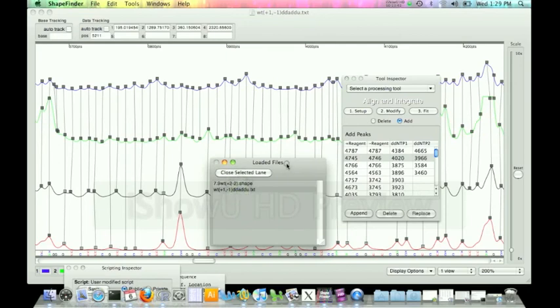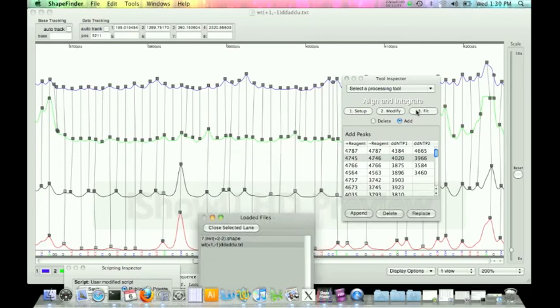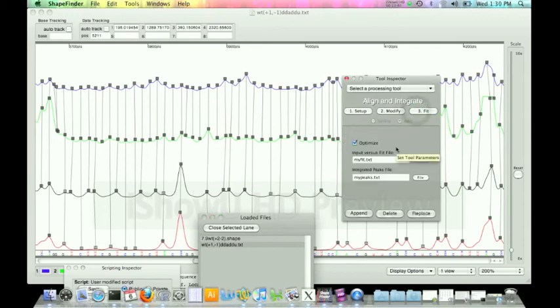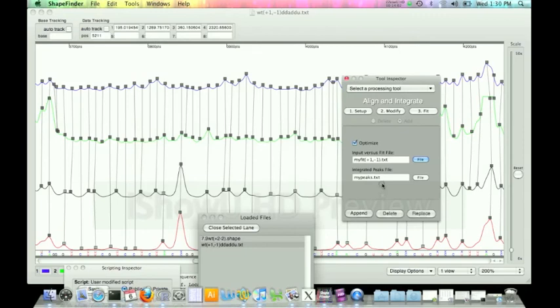So after you finish up and you do find all your peaks and you get it to line up with your other experiments, what you want to do is come in and fit. So now you want to tell the computer where you want to store the actual data from this file. So the fit is the fit to the data. What it's going to do is come through and draw a Gaussian. So I'm just going to do my fit +1, -1. And that's your fit. Where your data is going to be stored is this mypeaks file.